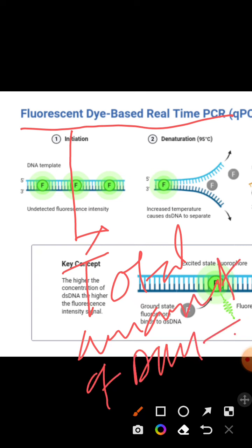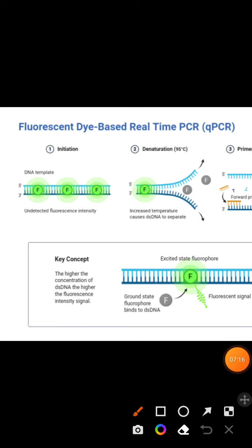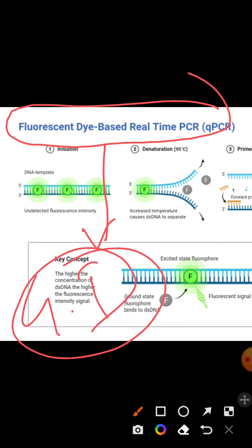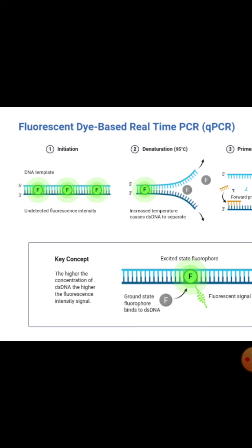by PCR, isn't it? But now the question is, can this fluorescence dye based real time PCR tell you whether or not your gene of interest that is present in the DNA molecule is amplifying? Is there any kind of confirmation? No. So how can you quantitate your pure amplified gene of interest, whether it is amplified or not? That is the reason we use another kind of fluorescent reagent, a sequence specific probe. But we are going to discuss the sequence specific probe within a minute.